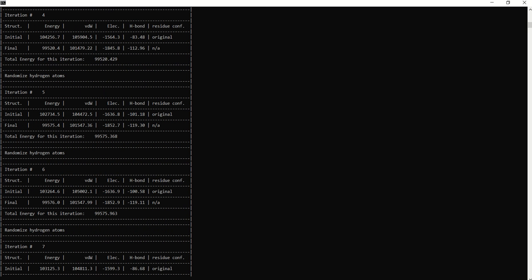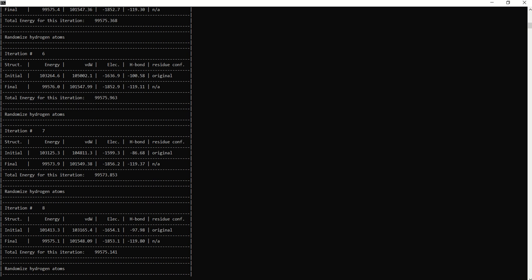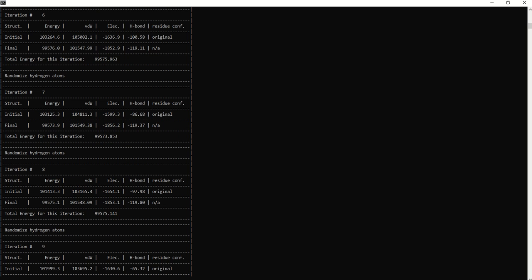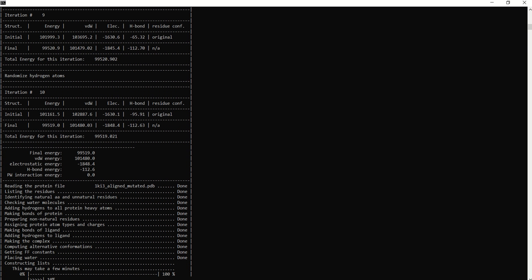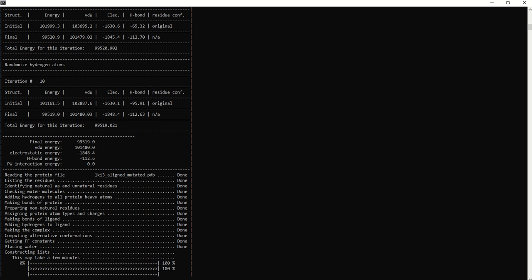So these names have to be changed. There's various other types of amino acids that can have different names from the common ones. For example, if you have a serine amino acid that has reacted covalently with a molecule, the name is usually not going to be serine. It's going to be some sort of hybrid of serine, like SGB. This also has to be changed back to serine.